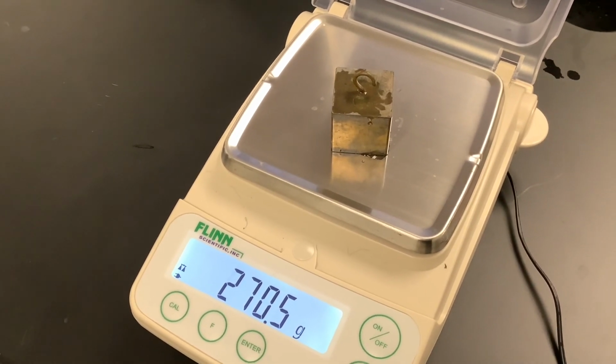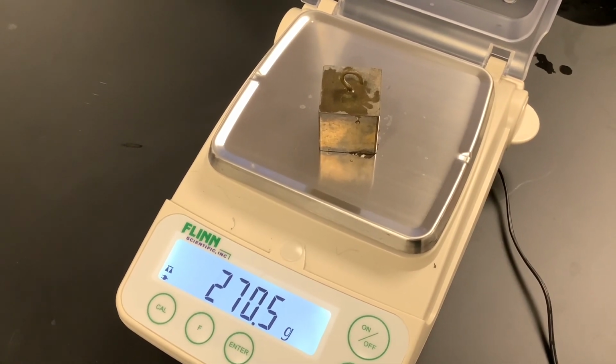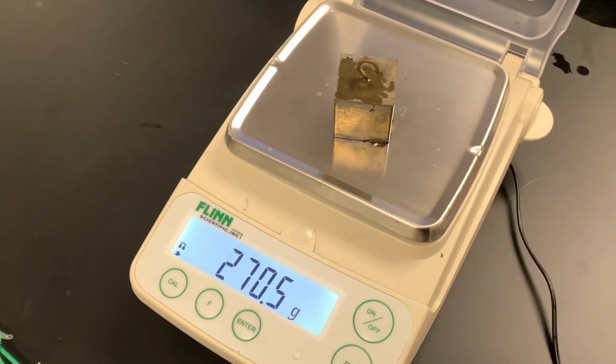Last piece of data is the mass. The mass of this cube is 270.5 grams. So go ahead and use that data, do the calculations, and identify this unknown metal number 2.